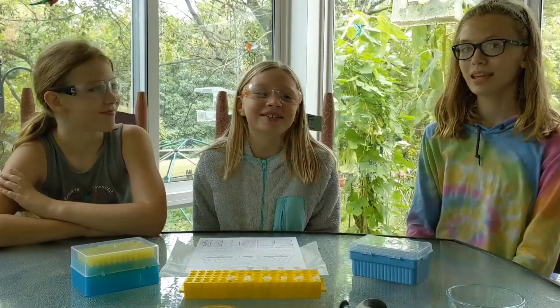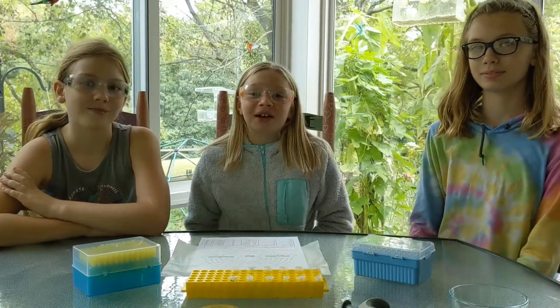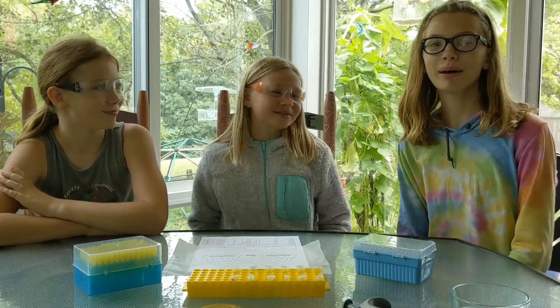My name is Lily. My name is Rowan. My name is Anna. And we're going to show you how to pipette the rainbow.